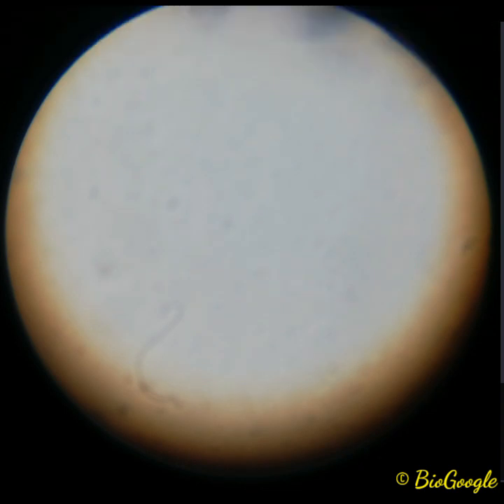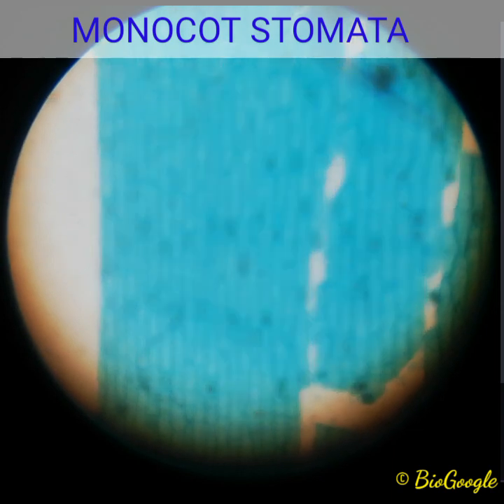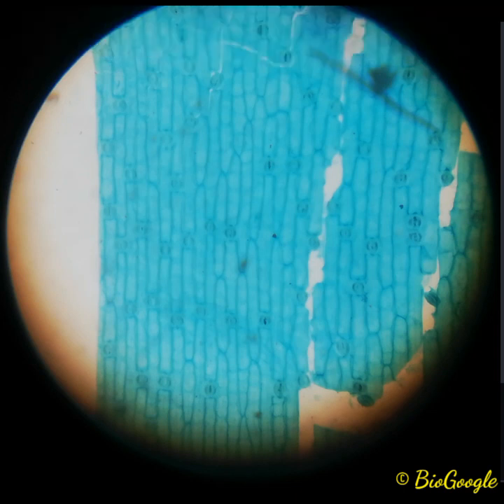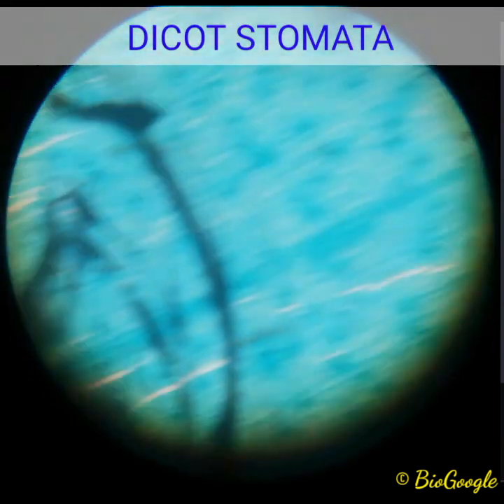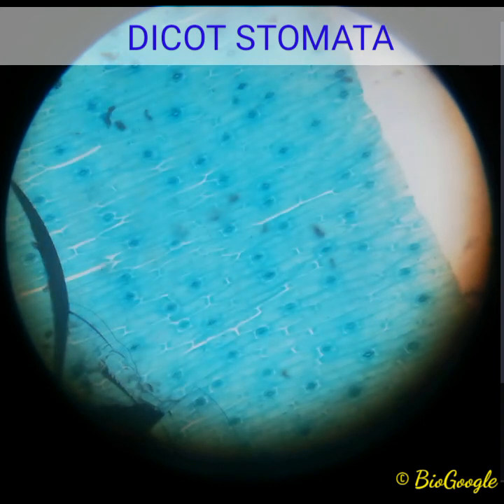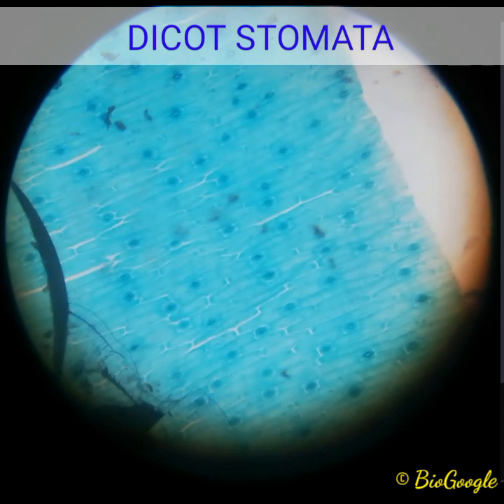That is stomata in a monocot leaf. The guard cells are dumbbell shaped in monocot stomata. Now moving to the dicot stomata — here you can see the dicot stomata with the kidney-shaped guard cells. These are the blue-colored mesophyll cells and the kidney-shaped guard cells of the dicot stomata.